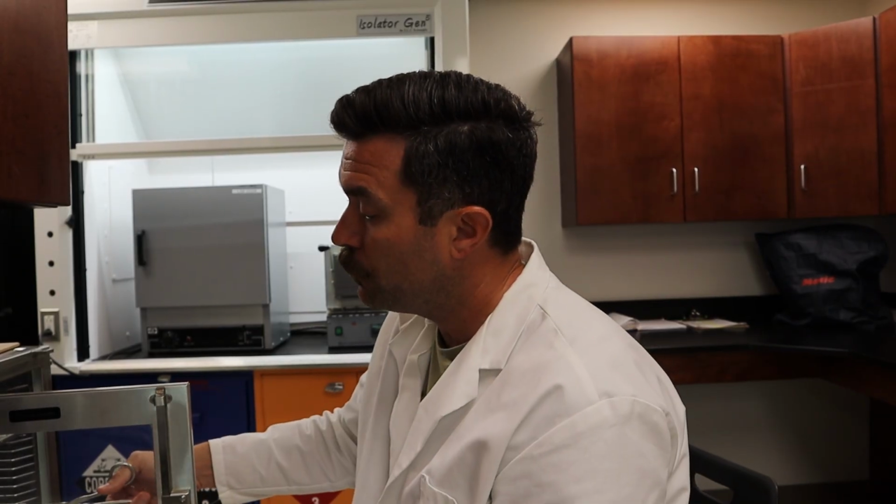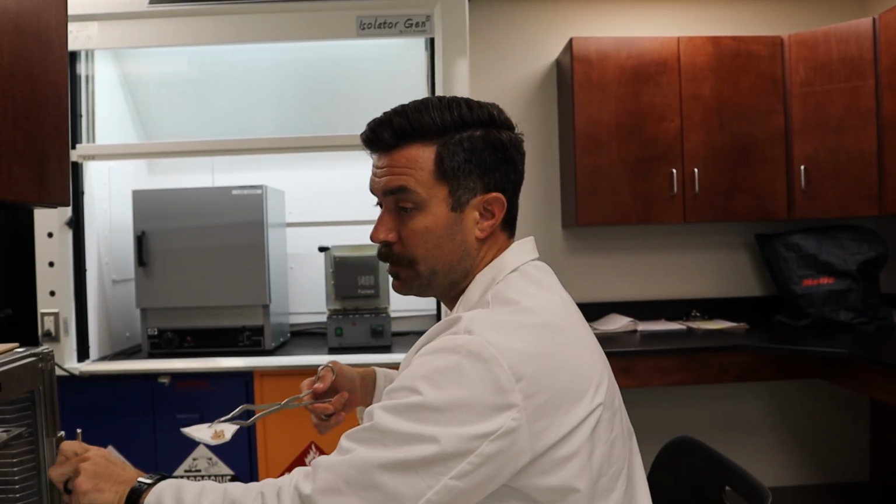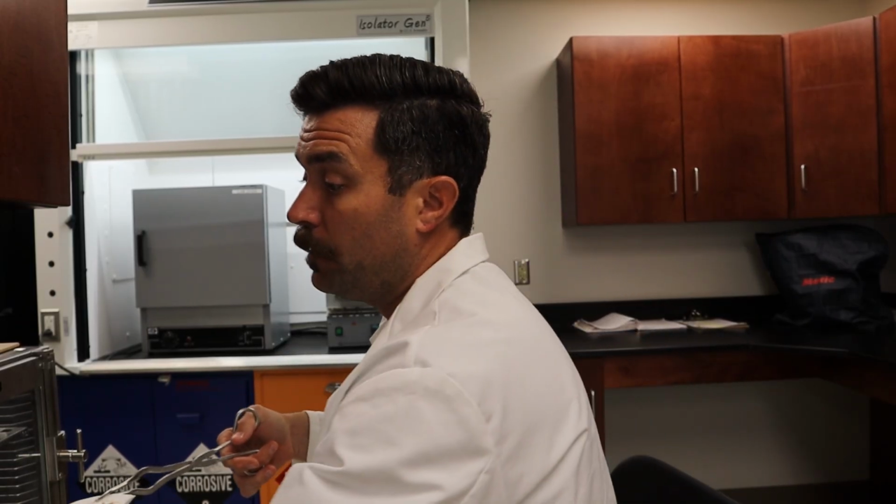We're going to remove the sample from the desiccator. It's out of the furnace, and we're going to set it back in the balance and let it balance, do its thing. As soon as we get this ash weight measurement, we will be able to then go over to the whiteboard and solve for our MLVSS, mixed liquor volatile suspended solids. Another very good thing to keep track of regarding process control.